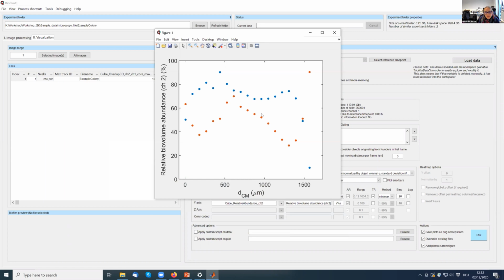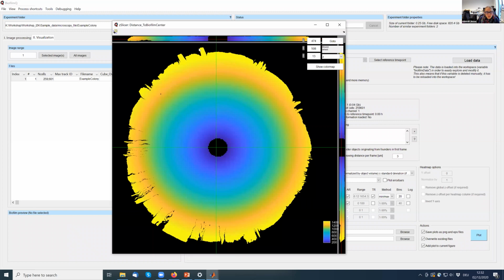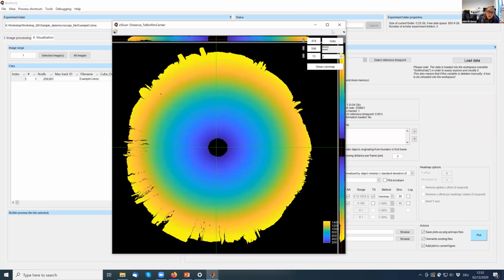And then we can see this one goes down. And as I predicted at this point here, the orange one is all the way at 90% in the end. And this is just because of this artifact that we introduced by not choosing the thresholding properly, because we wanted to do things fast. I mean, in reality, what you could do if you get this result and you know where it comes from, you could also say, okay, you cut it here.